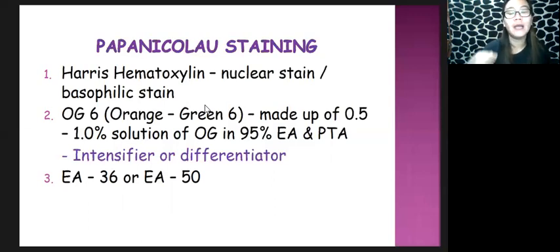Prior to dipping your smears into the stains, remember that the first step is to bring your slides to water. Please refer to the staining procedure in your module. You have there 95% and then 70% alcohol.